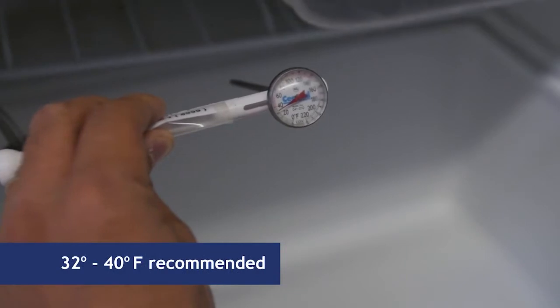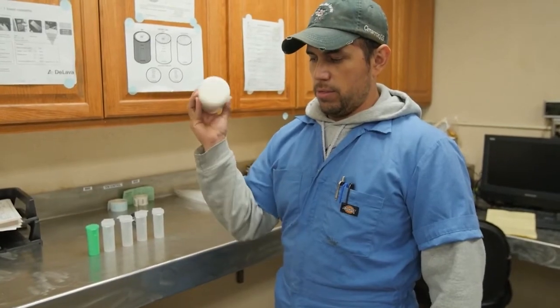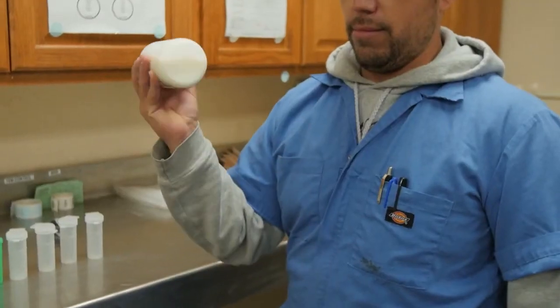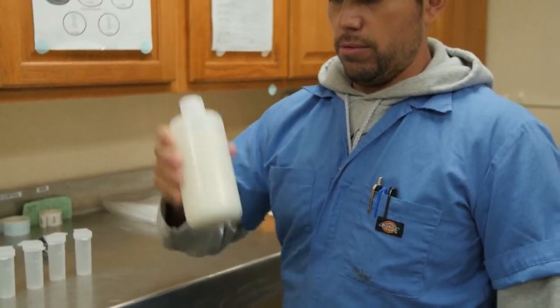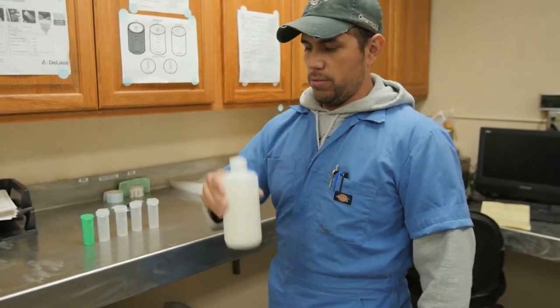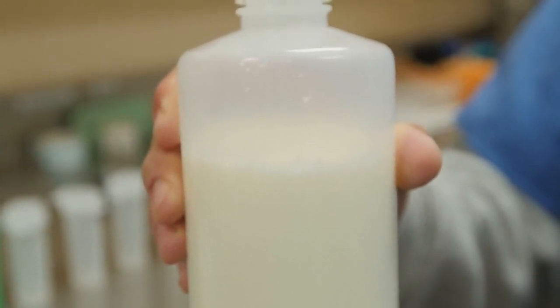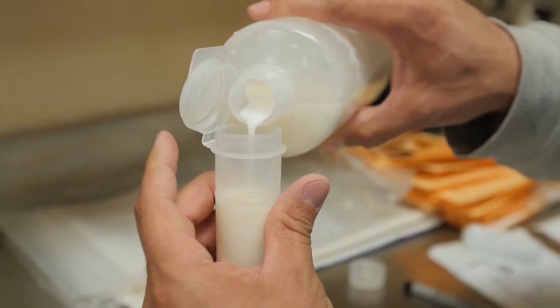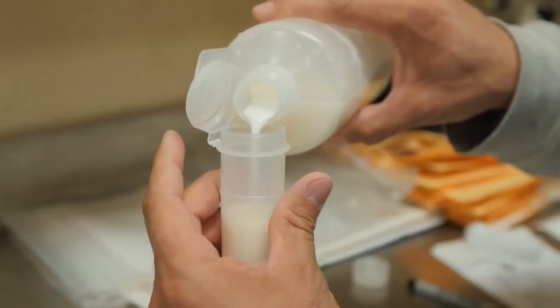Check and record the temperature in the refrigerator. It must be between 32 and 40 degrees Fahrenheit. Agitate the sample container sufficiently to obtain a representative sample by shaking the sample container 25 times in seven seconds with a one-foot arc of movement, or by rapidly inverting the sample container completely 25 times. It may be appropriate to wait three minutes to allow undesirable foam to disperse. Transfer a portion of the sample contents into smaller, properly identified, sterile sample vials. Follow proper procedures and do not contaminate the samples. Only fill each three-quarters full.